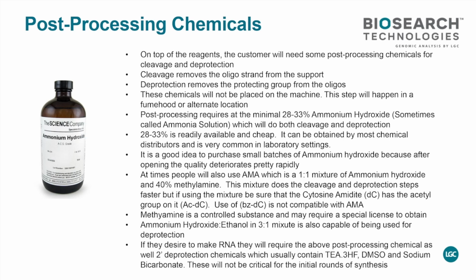1 part ethanol. Make sure that it's easy, lower temperature, and longer time. That way, it's much milder, the deprotection condition. It would not damage your oligo as much.